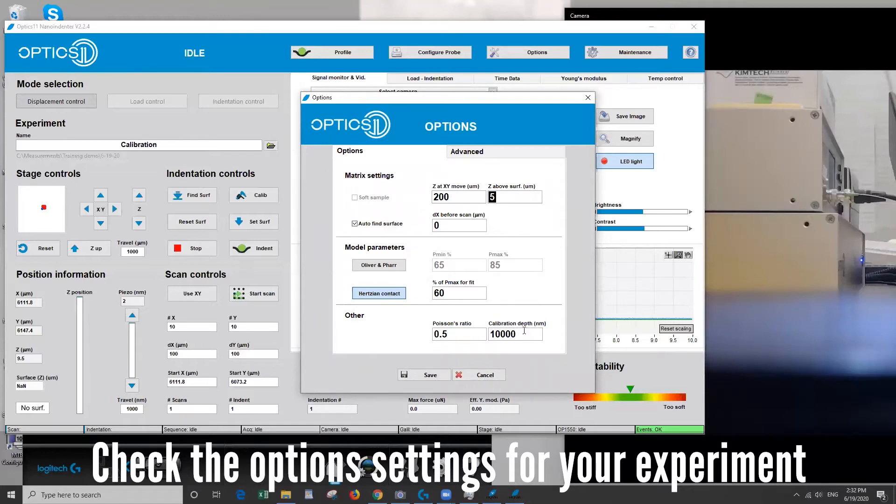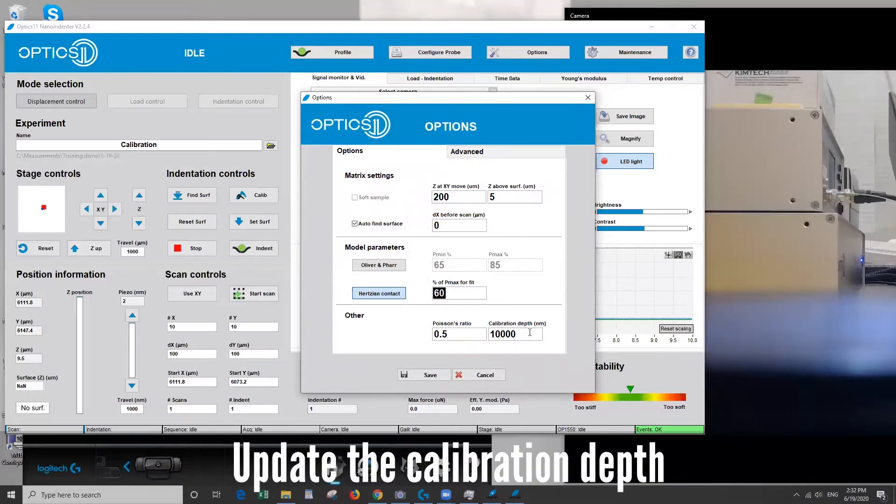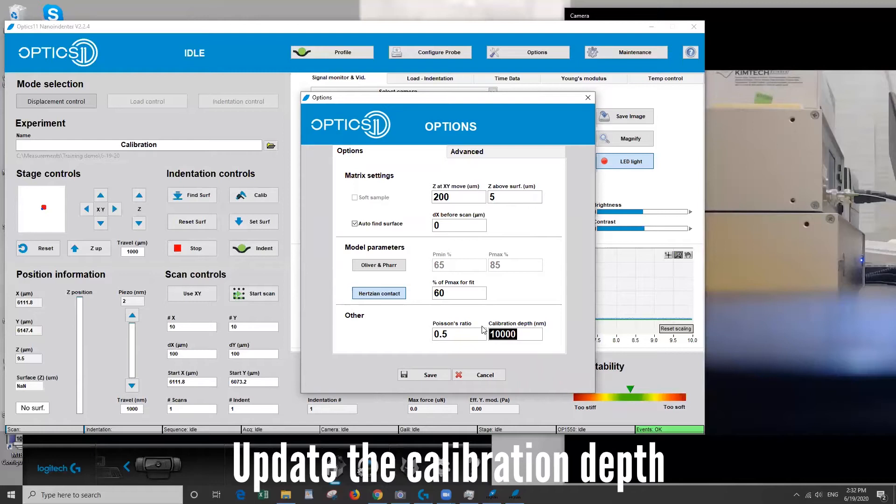And then down here this is how much you want to fit the data. How much percentage of that curve you want to fit with the Hertz model. The calibration depth is set to 10,000. That's the max. Make sure it's set to at least the amount that you plan on indenting. If not just leave it at the max if you're not sure.